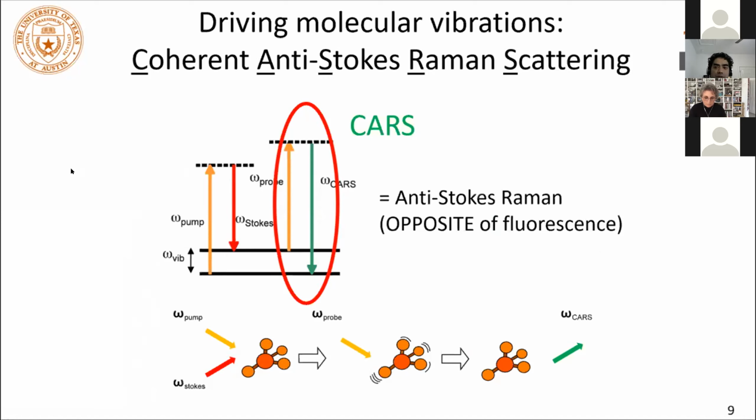In doing so, you've gotten rid of the autofluorescence problem, at least the linear autofluorescence problem. Because now if you excite with a green laser, you come out with blue light. Instead of exciting green and coming out red, which you would do in fluorescence, it's exciting green and coming out blue, which you would see in multi-photon fluorescence. Multi-photon autofluorescence is not necessarily the strongest thing in a lot of samples. It is there, but it's not as strong as the linear autofluorescence per se.